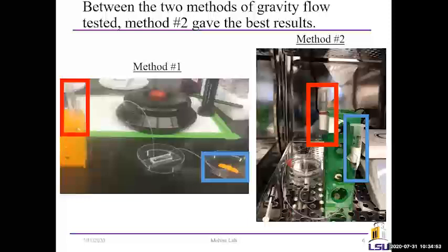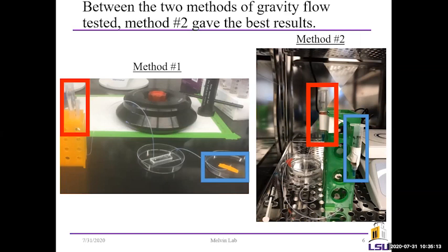And that matters for breast cancer research specifically because? The research that we're doing is growing small 3D tumors that are breast cancer to provide better drug screenings. Whenever our cells are culturing in the device, however, we face a problem where the cells die around 4 days into our culturing period. The goal of my research was to create a nutrient delivery system that would provide nutrients to our malnourished dying cells. Thank you.